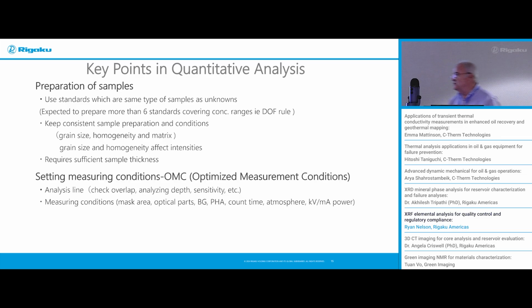And then setting the conditions. So you can do this manually, or most of the machines will use something, we call it guidance, that will set the conditions for you. Background points, PHA, count times, and estimating the analyzing depth, which is very important.